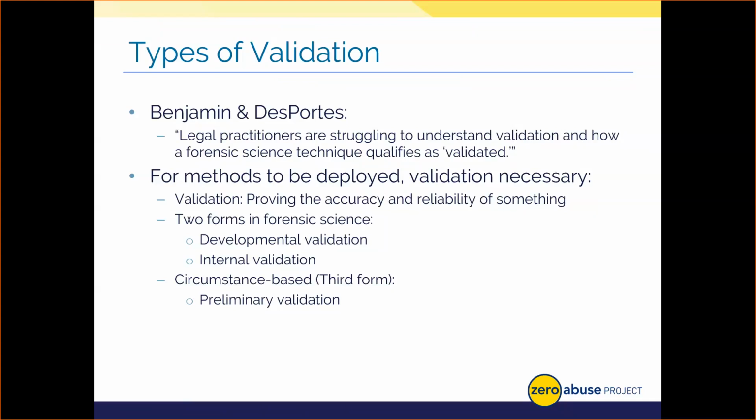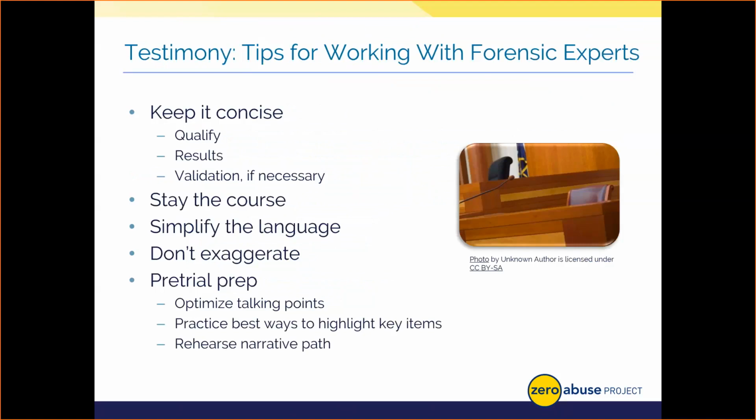These tests are pretty exhaustive and laborious. They're time consuming and they are costly, but this is great data that can showcase, right? Especially if you use internal validation, that can showcase just how accurate and how high quality your forensic testing laboratory truly is. Now, wrapping up then, the culminating event where you intersect with your lab and the results typically is going to be in court.